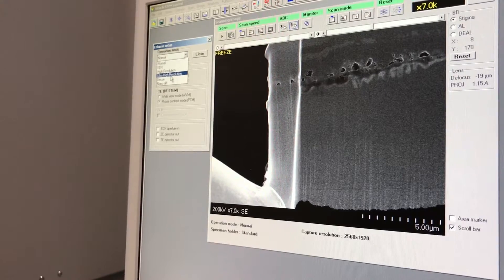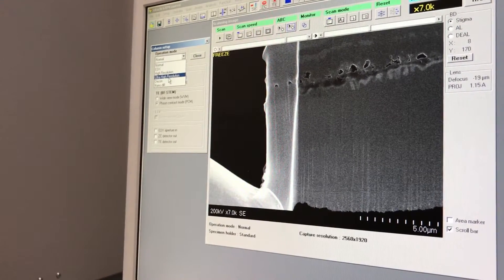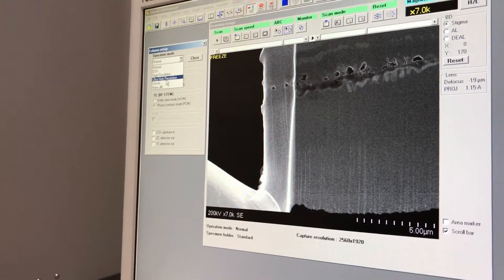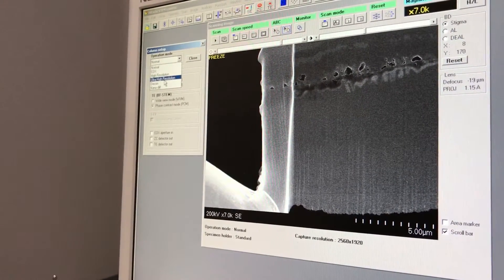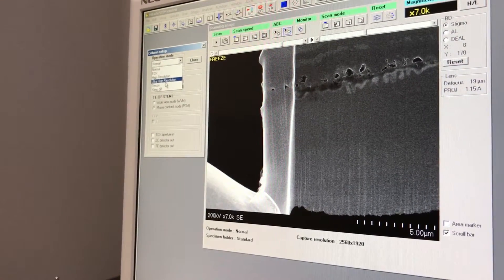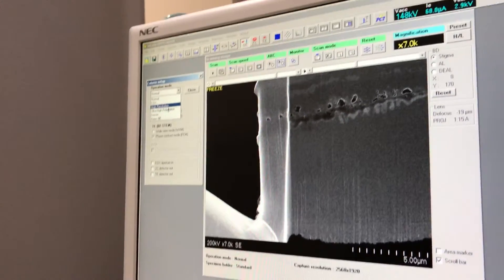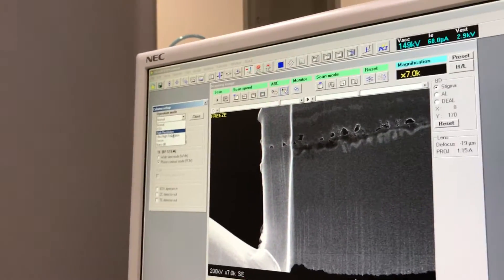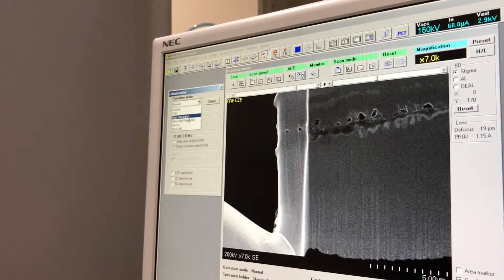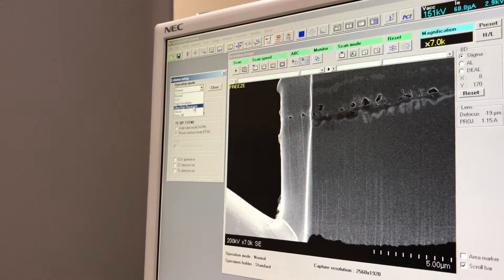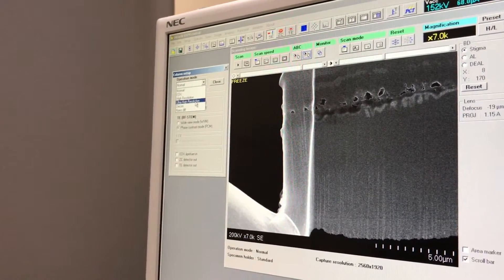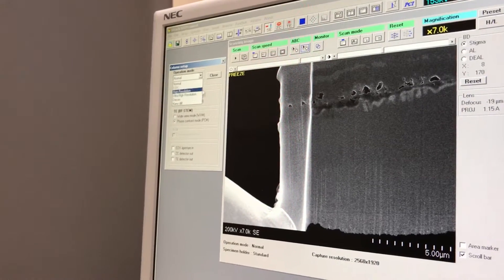Because it's not a reflection — it's transmission electron microscopy. It depends on the sample. Usually we start with high resolution, and if we see it's necessary, we switch to normal or ultra high resolution mode.